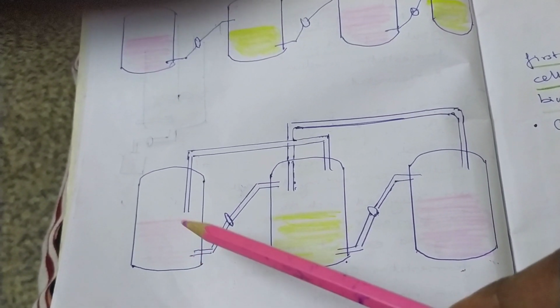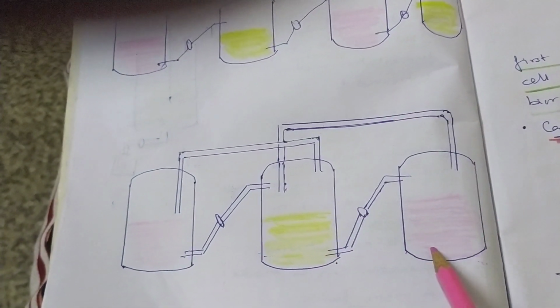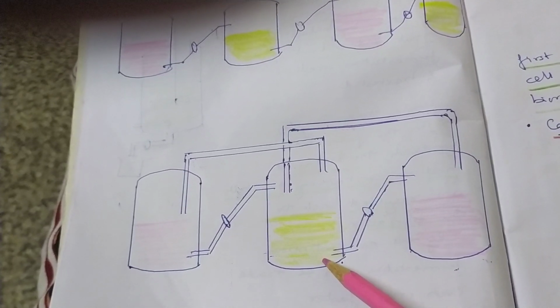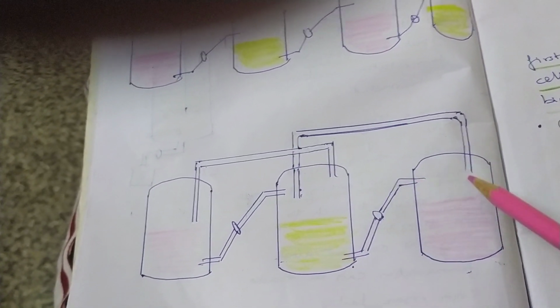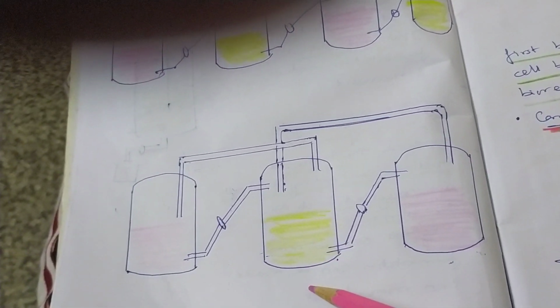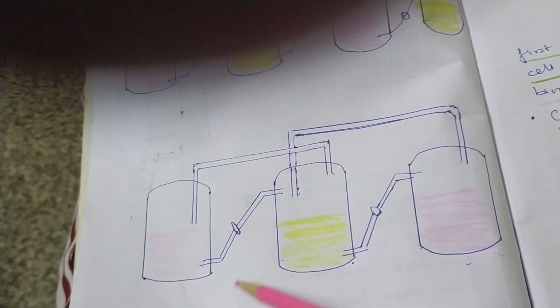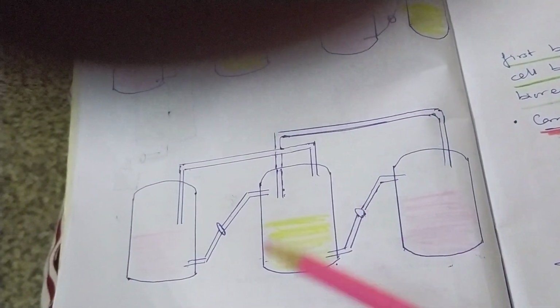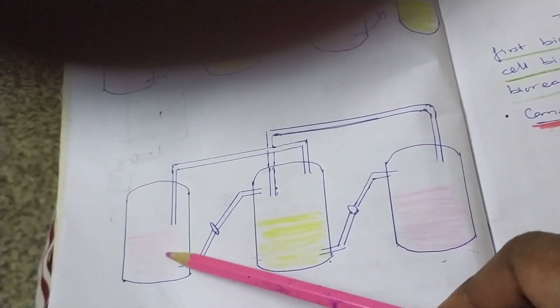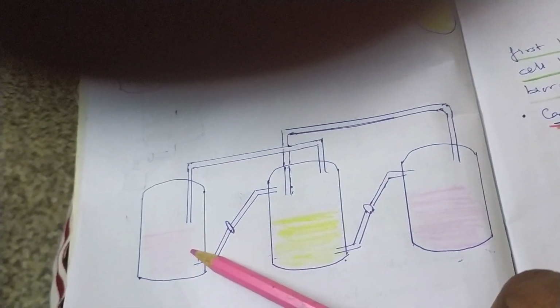Okay. By the time this bioreactor will get ready, within a few days this will get ready. That time this is ready for what? Harvesting complete. Though some amount of cells will be going here, this is ready for harvesting. By this, you can monitor this bioreactor and all. So at one point of time, maybe it has gone to the fourth or fifth, this will be empty totally. This goes for cleaning. All these valves are closed and it goes for cleaning.